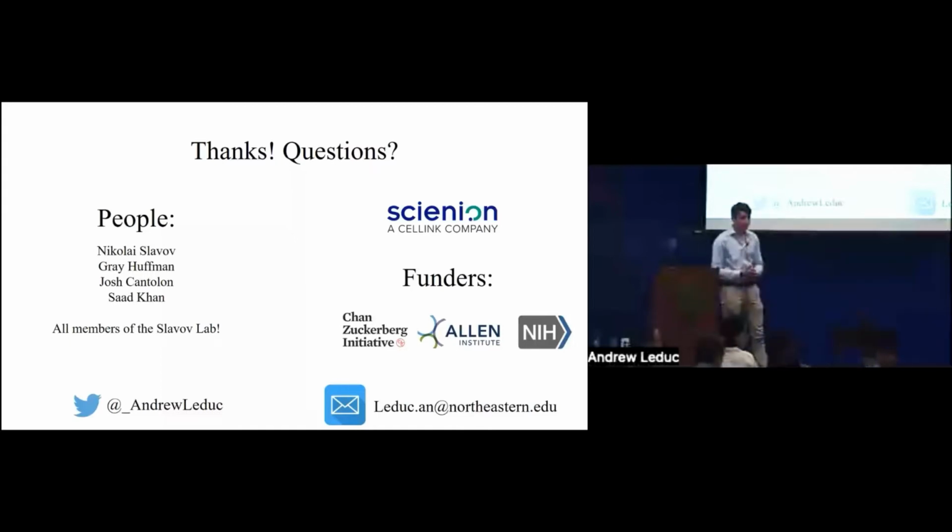Very nice talk. I want to ask you about assessing the accuracy of protein abundance measurements by comparing with diluted samples to say 5 cells. In some way, we want to study single cells because we say that single cells are different than large populations, right? And here you're referring to diluted cells and saying, oh, it's good that we have a very low variance that's centered around 1, right? So it's a questionable way, I would say. I'm not saying it's a bad way. It's probably the best you can do, but if you can comment on that.